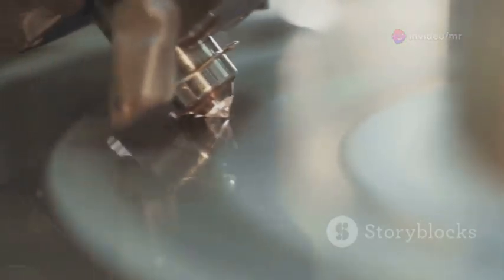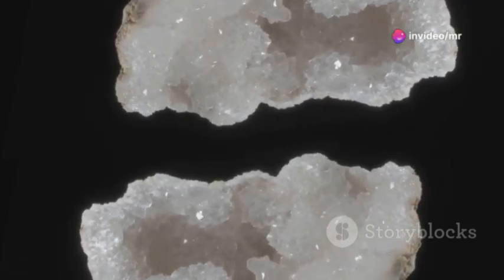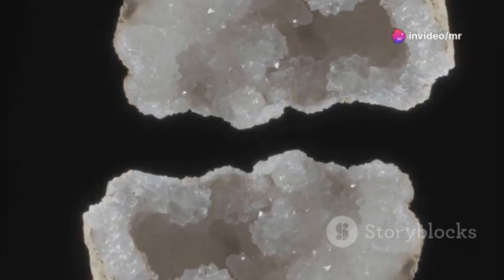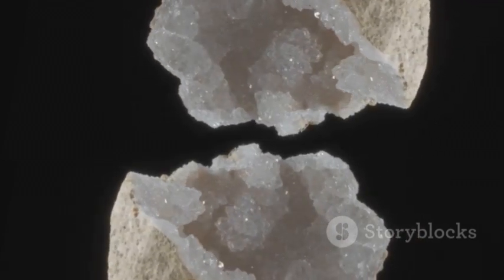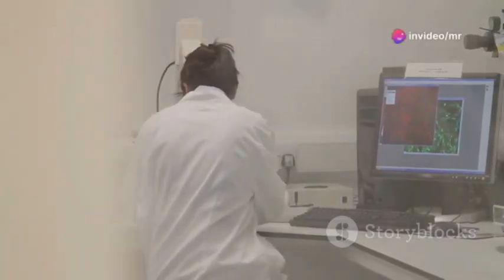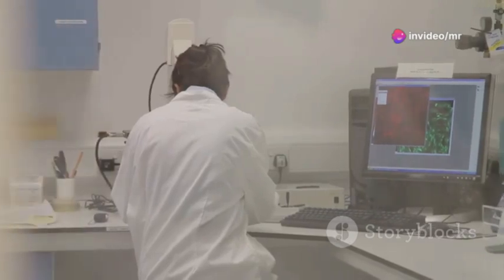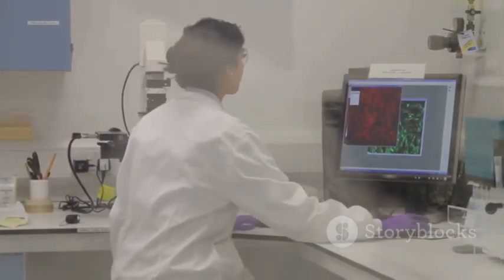Diamond is super hard, making it ideal for cutting tools and jewelry, while graphite is soft and slippery, perfect for use in pencils and as a lubricant. Why? Because their atoms are arranged differently. In diamond, each carbon atom is bonded to 4 others in a strong three-dimensional network. In graphite, carbon atoms form layers that can slide over each other easily. XRD can easily distinguish between diamond and graphite based on their unique diffraction patterns. These patterns act like a signature, revealing the material's internal structure.